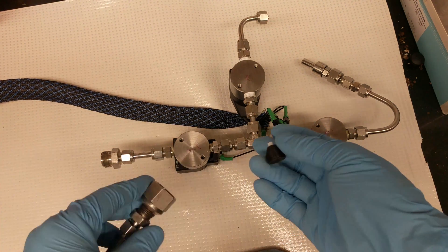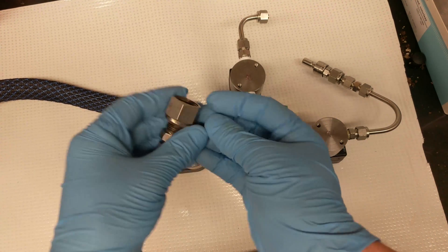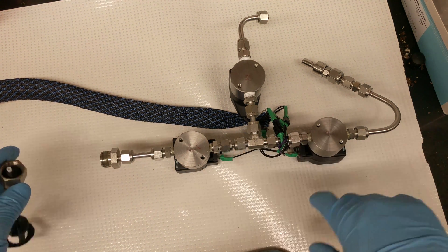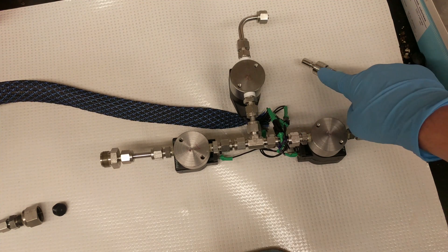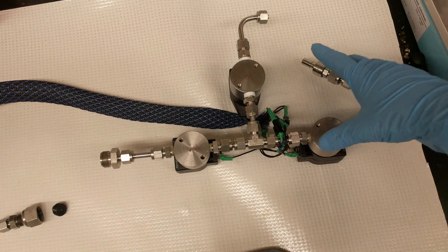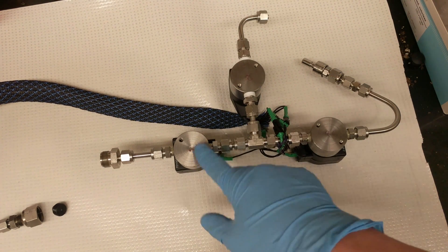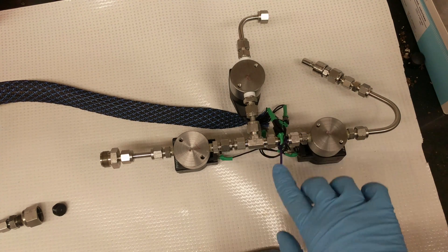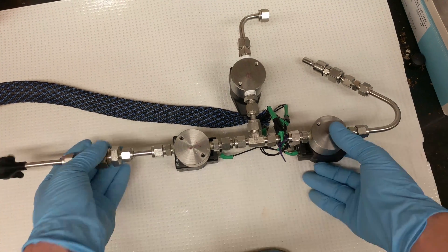The gene gun is working. I just need to get it up to a professional level where I can call this a finished project. The major differences: I've gotten rid of the gauge and the pressure transducer, because now I'm running the gene gun off a helium tank, connected through a quick connect fitting into a solenoid. That's a major change — using helium, which is allegedly better for gene guns anyway. There's also another solenoid just to vent any excess gas after you're done, for safety. Anyway, I'm hard at work on this thing and I think it looks sweet.